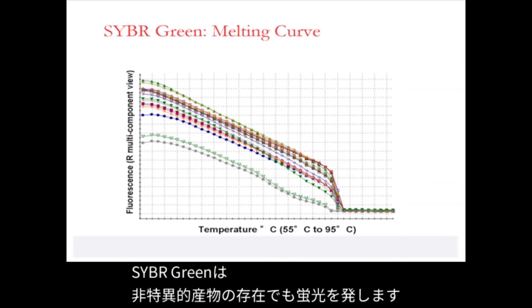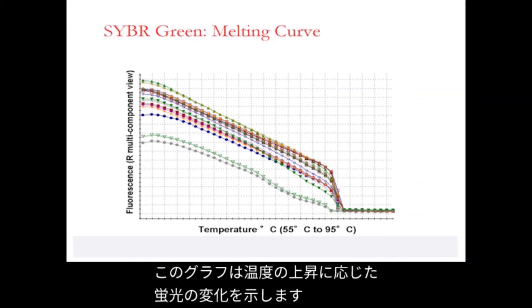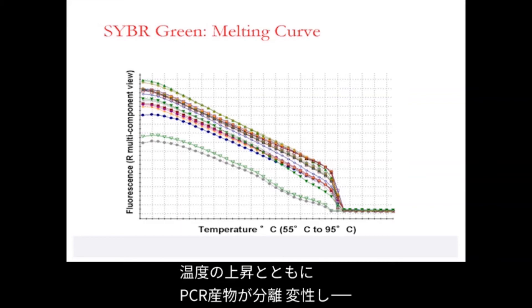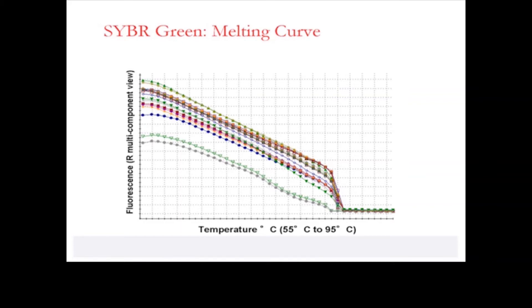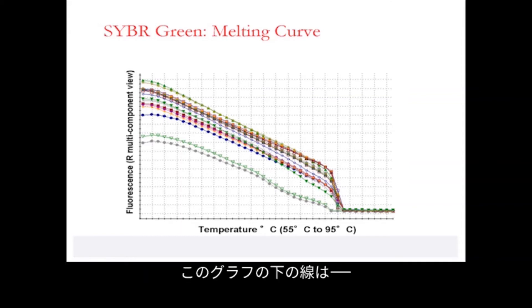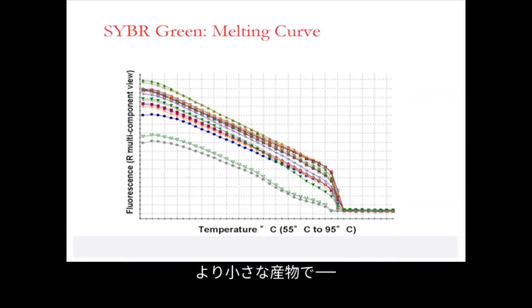SYBR Green 1 will fluoresce in the presence of non-specific products. In this graph, we observe the change in fluorescence as temperature increases. As temperature increases, the PCR product will separate, denature, and SYBR Green 1 will drop off. The lower line in this graph shows a product which denatures at a lower temperature, indicating a smaller product which is double-stranded and consists of primer dimers.